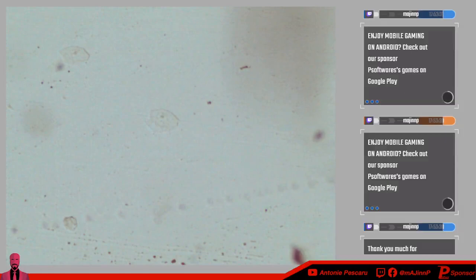All right. As you can see, this right here is our epithelial buccal cells. Interesting fact about epithelial buccal cells: the word epithelial comes from the word epithelium, meaning skin. Buccal means found in the mouth.